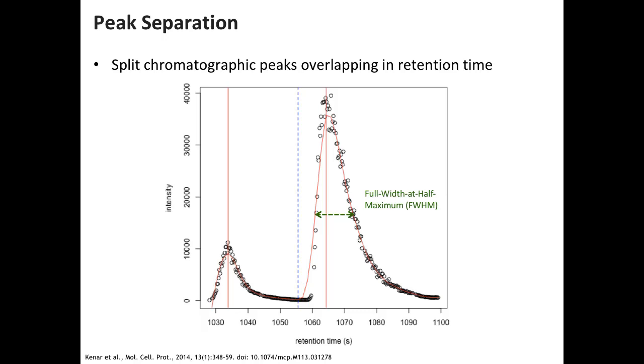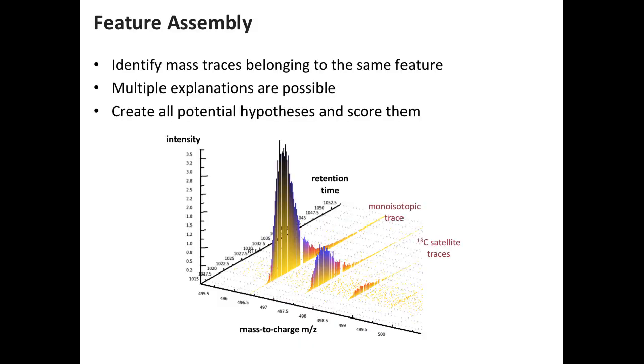So we basically try to figure out whether our mass trace is clean. And that is where these long mass traces become problematic, because you can still have features on top of this baseline level. That's a bit tricky to disentangle again. Now we have to assemble these features.